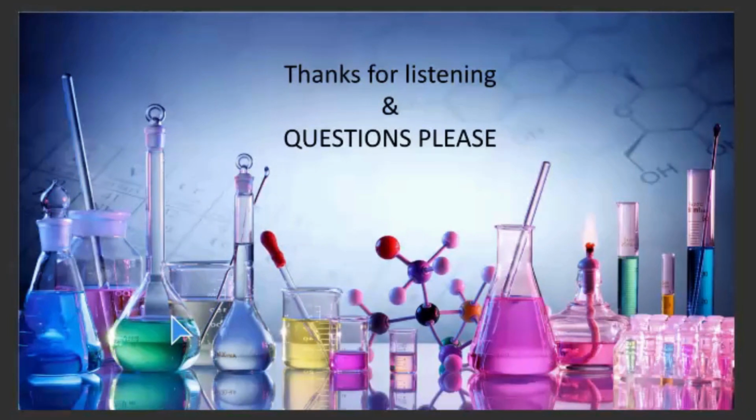Thanks, Simon. How about other open source software that is quite useful to use for the software packages? What do you use currently? Open source wise, again, MS Dial I use quite a lot. If you're talking about chemometrics type of approaches, there are open source things like that which are available if you hunt around the internet, free add-ins for Excel and other things like that.